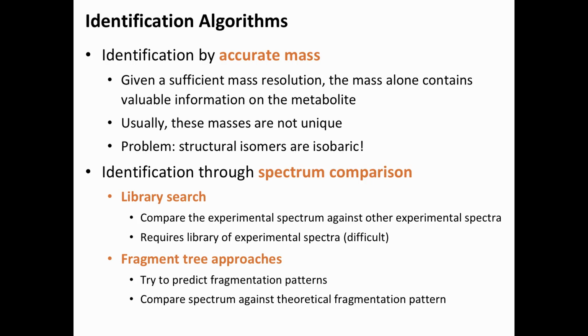That's basically what we did in proteomics, except that in proteomics, predicting these spectra was trivial, because it either broke at a peptide bond, you get a B ion, you get a Y ion, done. The whole thing is linear, there's not much to do. But if some of you have ever done gas phase chemistry in mass spectrometry, either theoretically or really worked on the spectra, you know that funny things are going on in mass spectrometers.